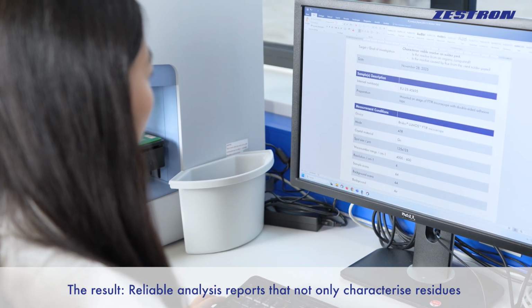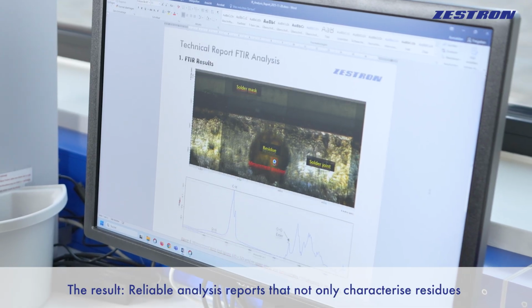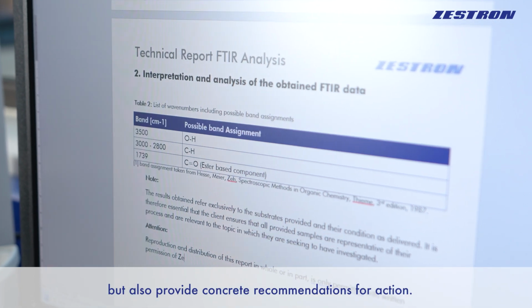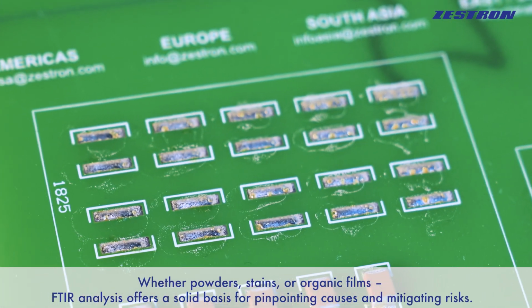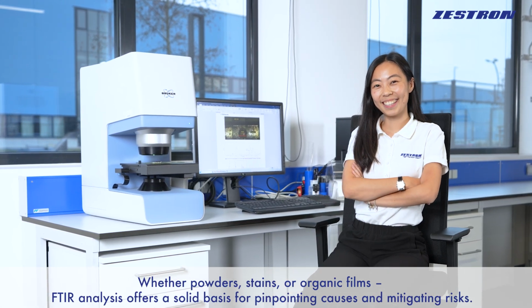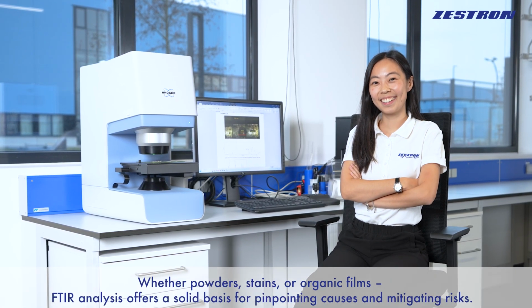The result: reliable analysis reports that not only characterize residues, but also provide concrete recommendations for action. Whether powders, stains, or organic films, FTIR analysis offers a solid basis for pinpointing causes and mitigating risks.